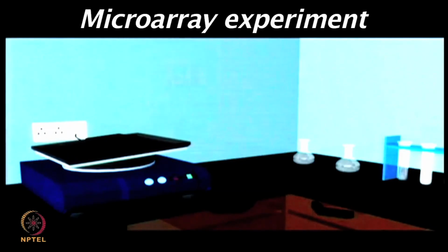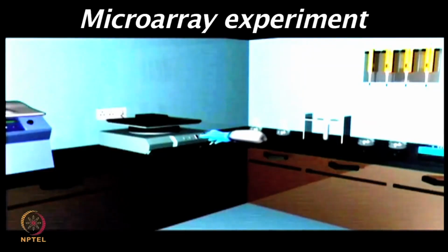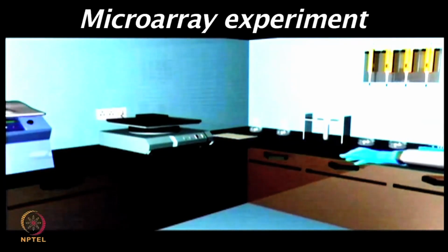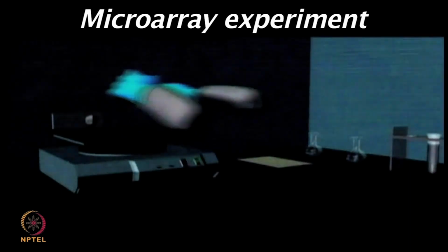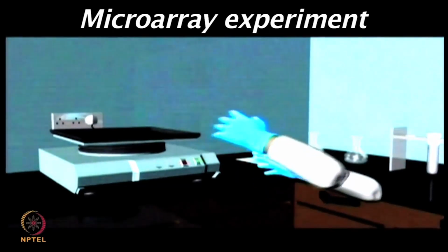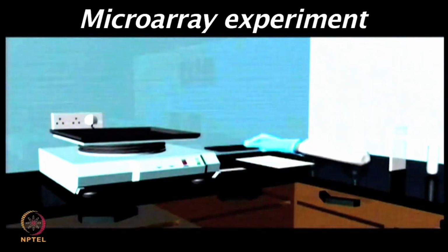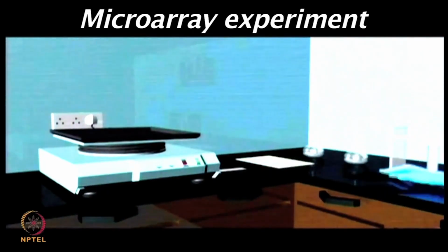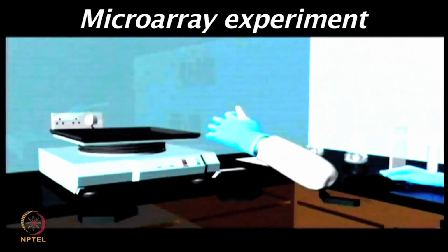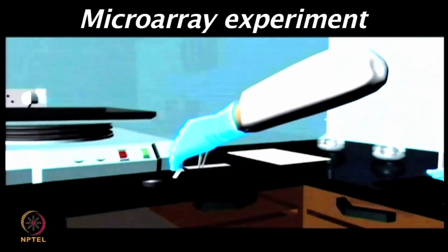After the blocking step is completed, remove the slide from the blocking solution and tap it against a paper towel, so that one can remove the excess milk. So, as I mentioned, one needs to ensure that there is continuous mixing of the slide, because if it is left sitting on the rocker without mixing, then the slide will dry and it will appear dark when you are scanning for the different types of features.